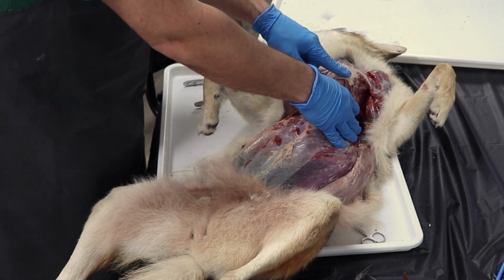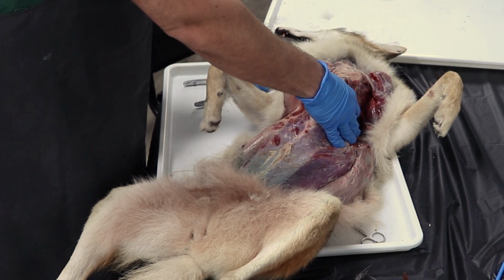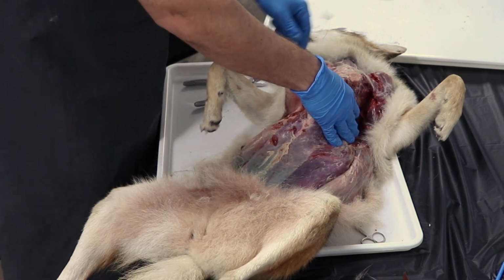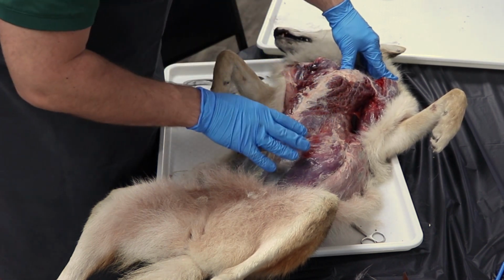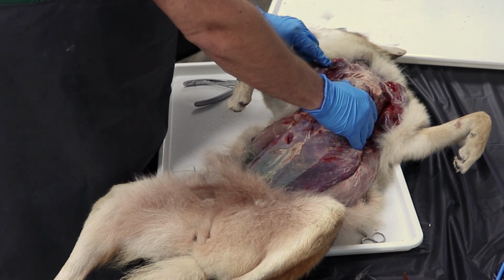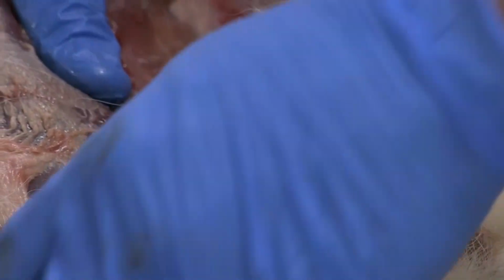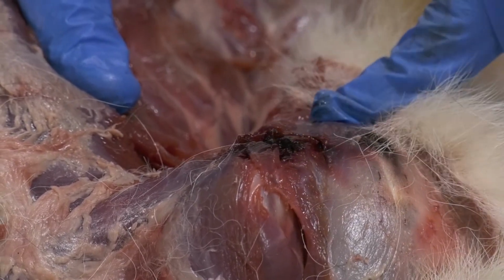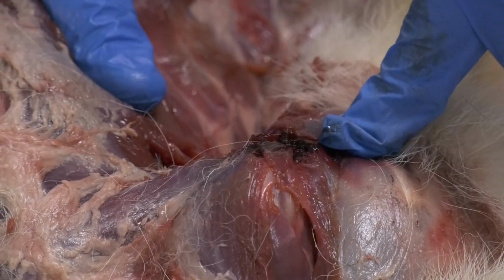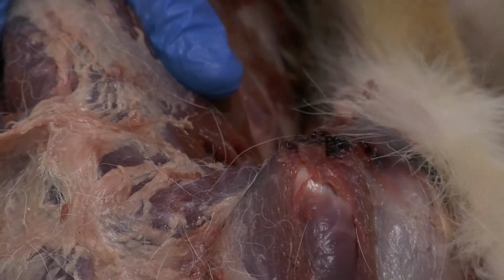And one thing I do notice, so we've got some subdermal fat layers here. All right, we have that underneath our skin sometimes. But one thing I do see here is an injury. If you're watching this video, you'll see all sorts of injuries that I made to the musculature through my bad dissection here. But this right here in the shoulder, you see that this blood has gotten a good deal darker, and it's coagulated, unlike the wounds that I just made over here. This right here is a wound that this animal encountered that might have been part of its demise. I don't think that this all by itself would be enough to kill it, but it could have been part of that vehicle strike that did kill it.